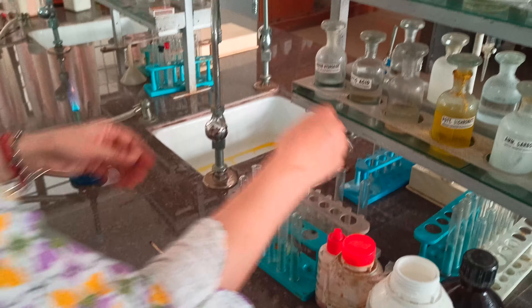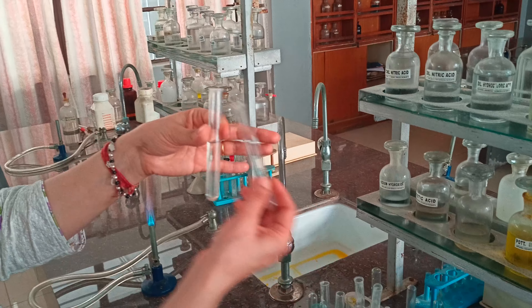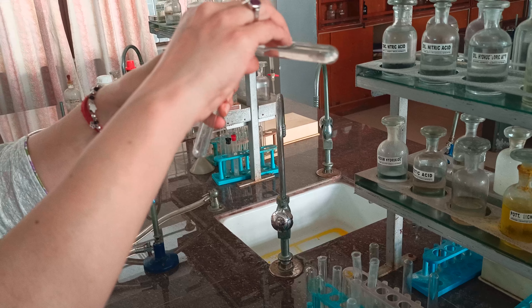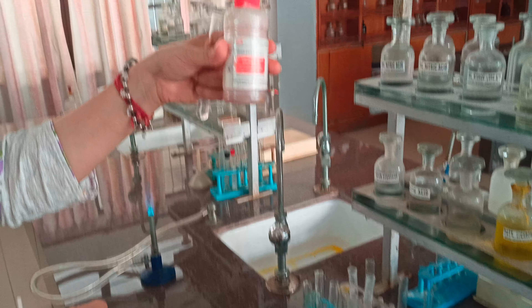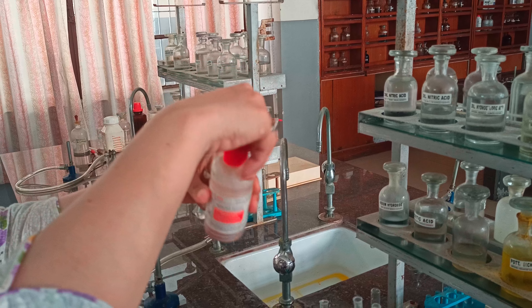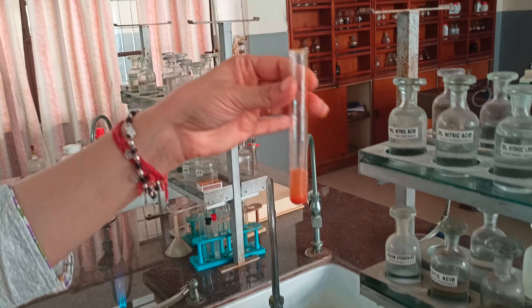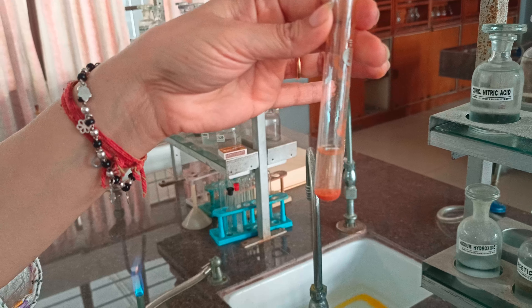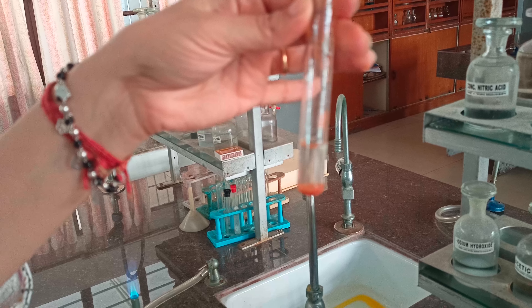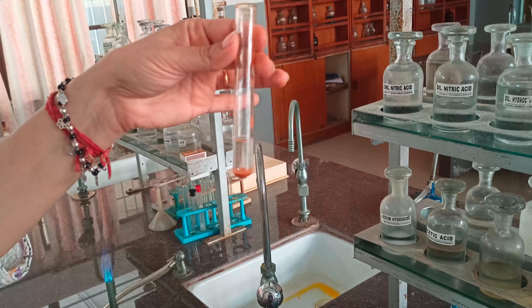For the second test of the ammonium ion, we prepare an aqueous solution of the salt. To part of this aqueous solution, we add Nessler's reagent. It gives a confirmatory test — Nessler's reagent gives brown precipitates for the ammonium ion. This way the cation is also confirmed. Hence, the salt is ammonium chloride (NH₄⁺ Cl⁻). Thanks very much.